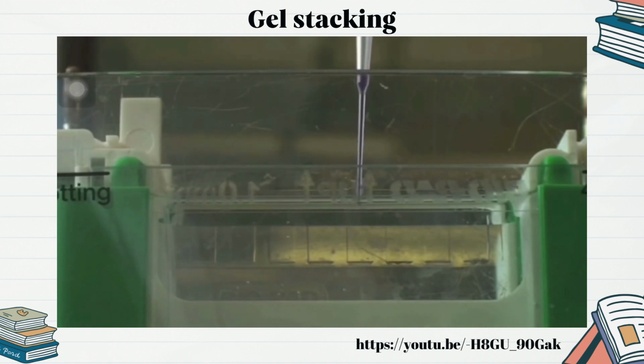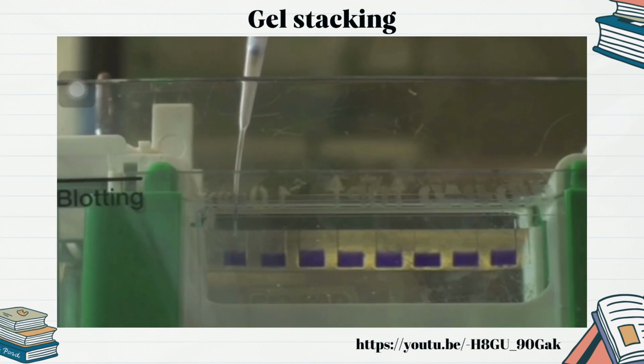The pipette tip should be inserted into the well in between the plates, deep enough to prevent overflow of the sample to the neighboring lanes. Slowly release the sample solution. Remove the pipette tip, change the tip, then load another sample.